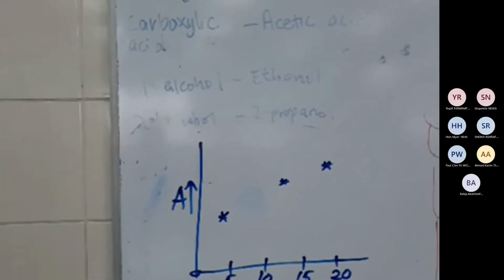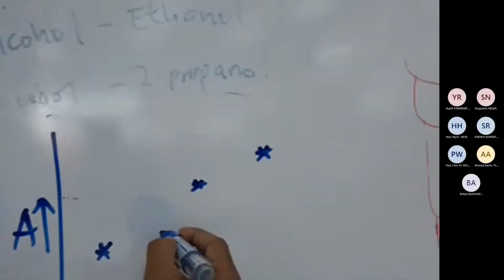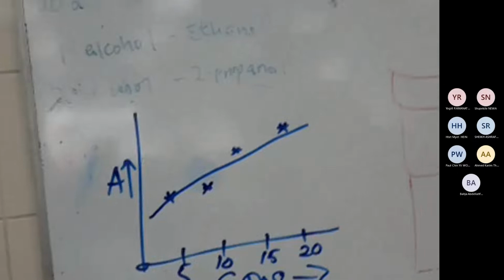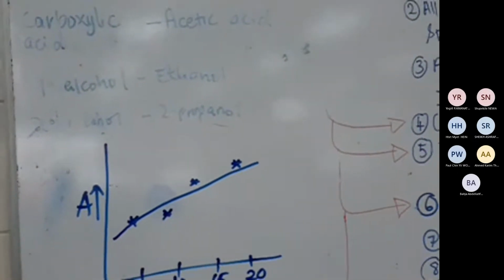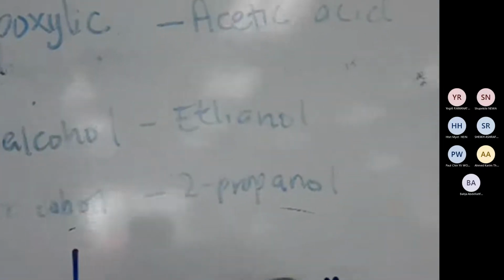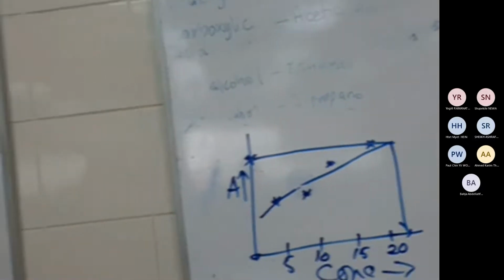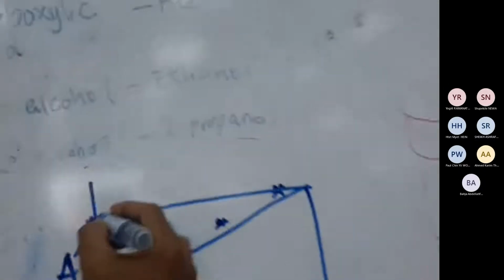When you produce a little bit of error, somehow it becomes a little bit less. And the data you produce in this way gives the curve, the line. So when you find the unknown, the absorbance, you make the line and then you find it here. If the unknown is there, that I found, this is the unknown.